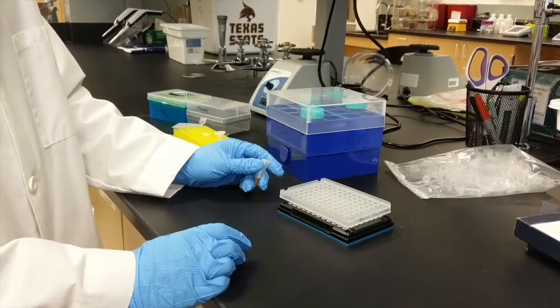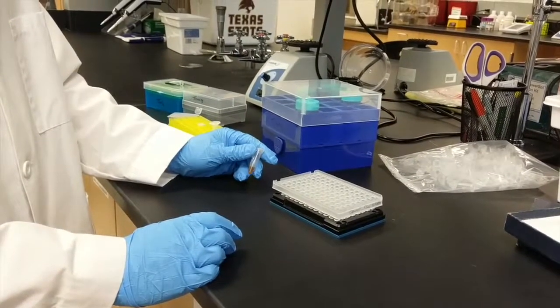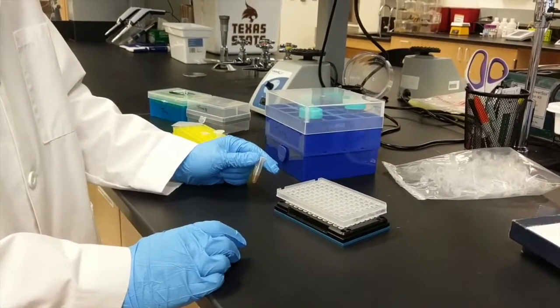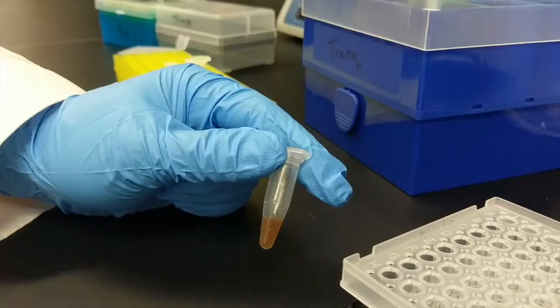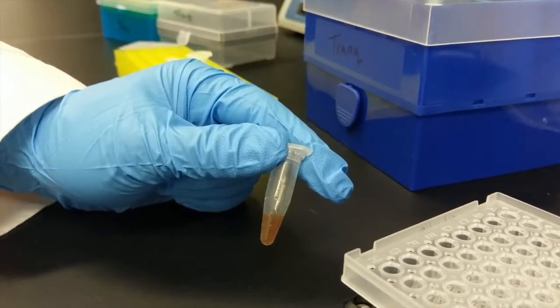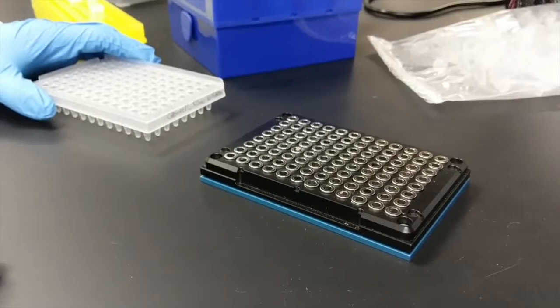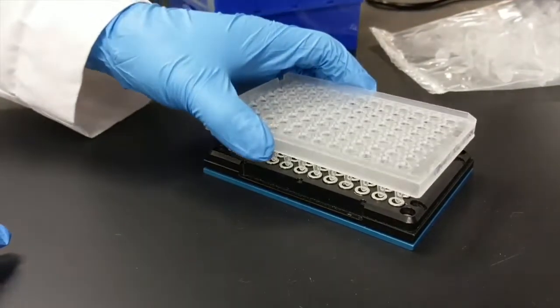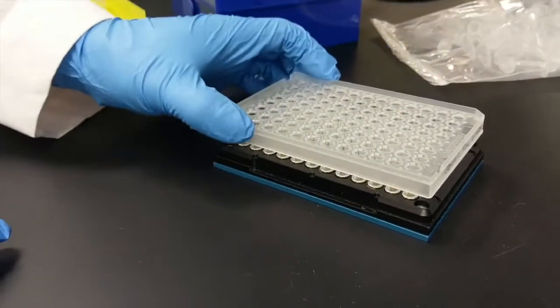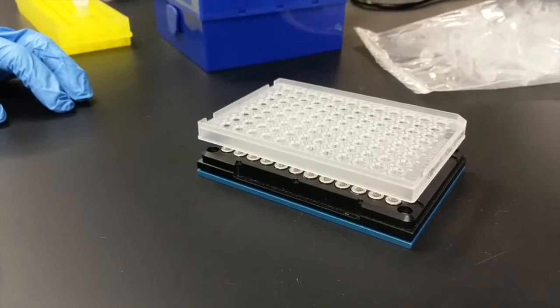Now that we have finished fragmenting our DNA, we have to clean it up. Cleanups are going to take place throughout the library prep process, and the reason for this is that many of the reagents need to be cleaned up so we just have pure DNA. We'll use the Serapure beads, which the DNA will bind to, but none of the reagents will. We will be able to separate the DNA by using these magnets: the DNA is attached to the beads, and the beads will be attracted to the magnets. Once that is concluded, we will have pure DNA ready for our next step.